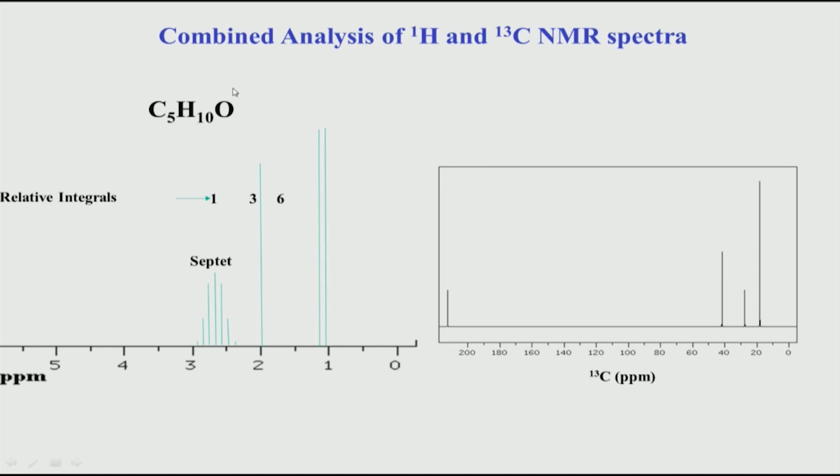Of course, it can come from an IR spectrum, but suppose I do not have an IR spectrum, I have only NMR. By looking at the spectrum, immediately I can see that there is a peak at 220 ppm, and that 220 ppm is very strongly going to come from a ketone group, according to that picture chart which we saw. So, immediately I can conclude that there is a ketone functional group in this molecule, that means there is a C double bond O. Now, I have the remaining 4 carbons to look at and the remaining 10 hydrogens.